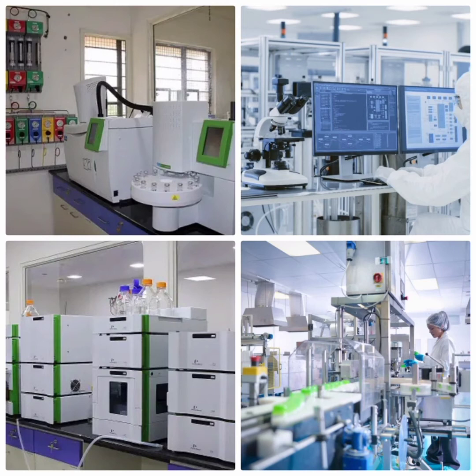This is a big benefit if the systems are procured from the same manufacturer and multi-user licenses are obtained. Such software also helps the analysts to set up operational parameters and methods sequencing.